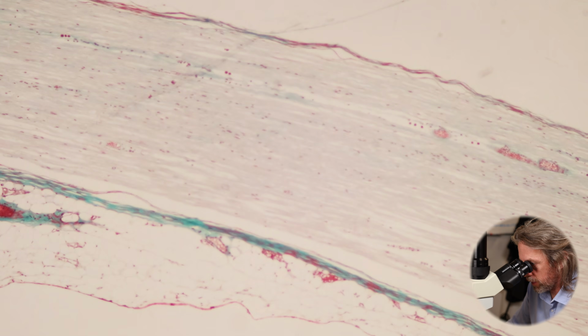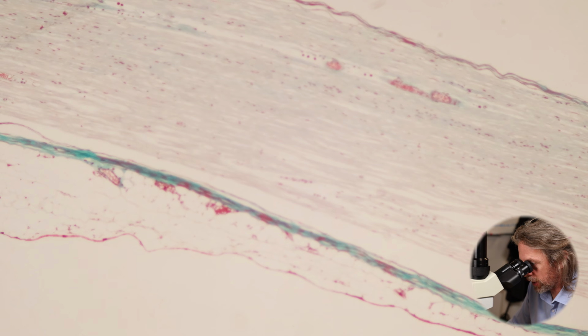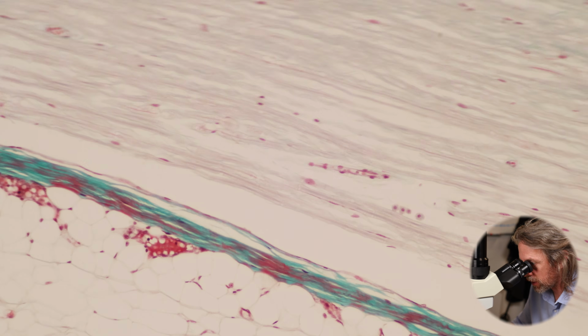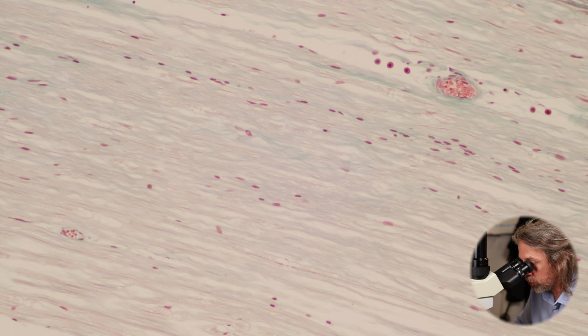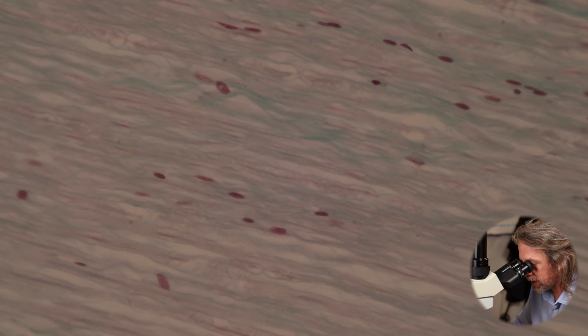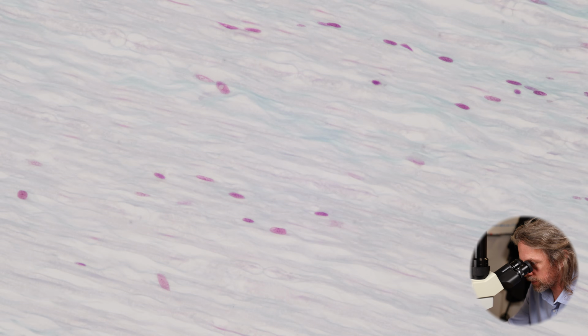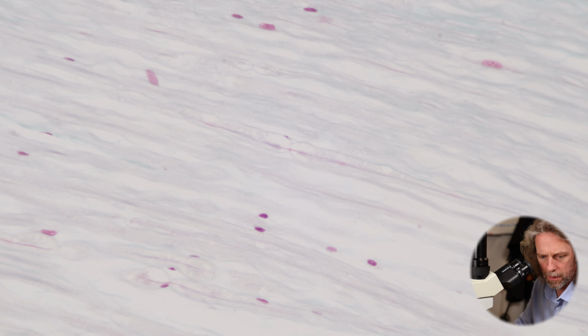So we're looking at a peripheral nerve, but we're now looking at it in a longitudinal section rather than in a transverse section. So we're looking at the lengths of the axons, not cutting through the axons, which is why we're seeing long streaks instead of circles. So this again looks like it's stained in Masson's trichrome. So we've got a lot of green because we're seeing that connective tissue. Oh, right, there we go, right there, bam. That was easy.